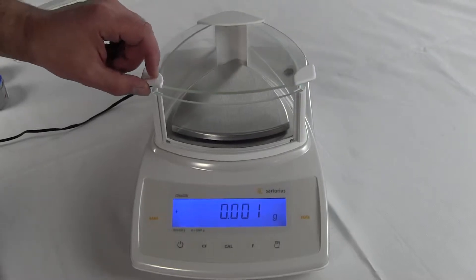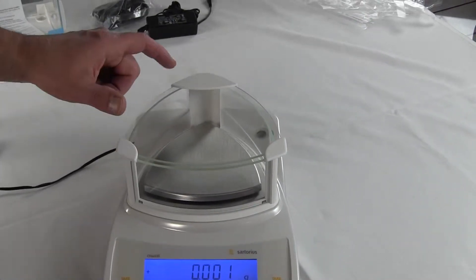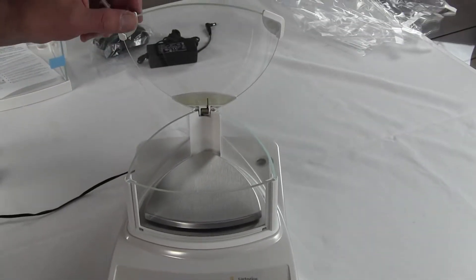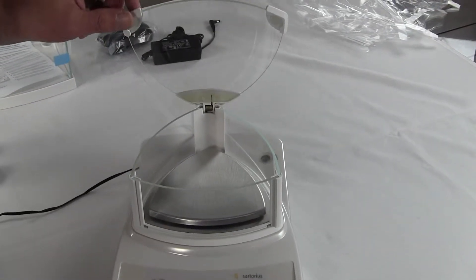You'll notice the draft shield. We're using an all-glass draft shield. A lot of low-end milligram balances on the market today are using plastic. This is a glass draft shield.